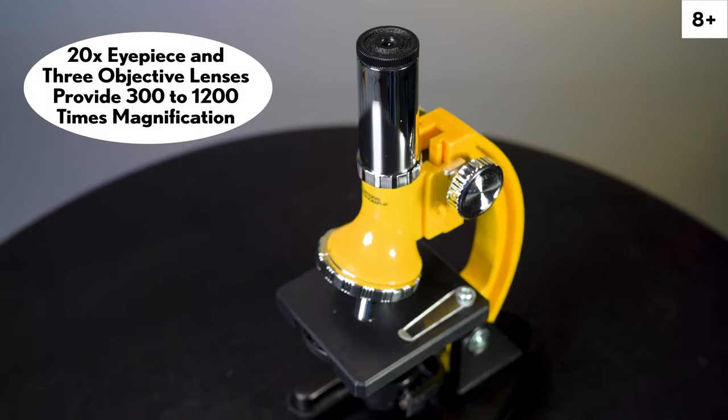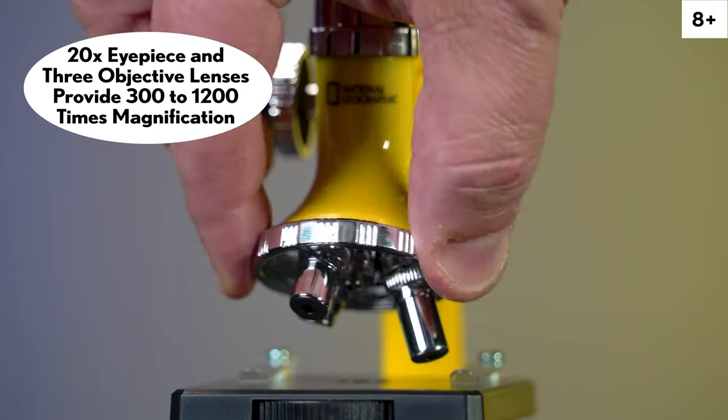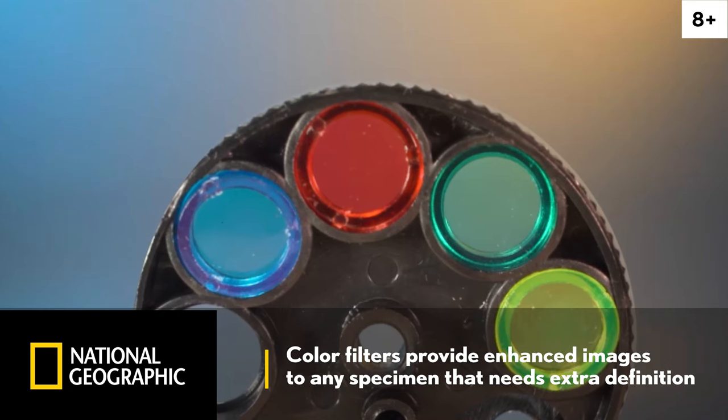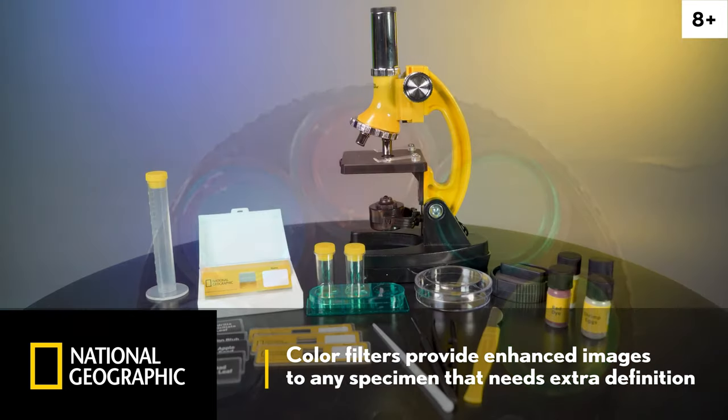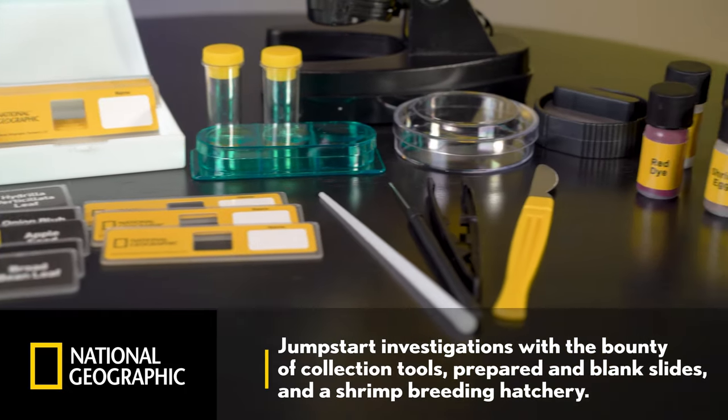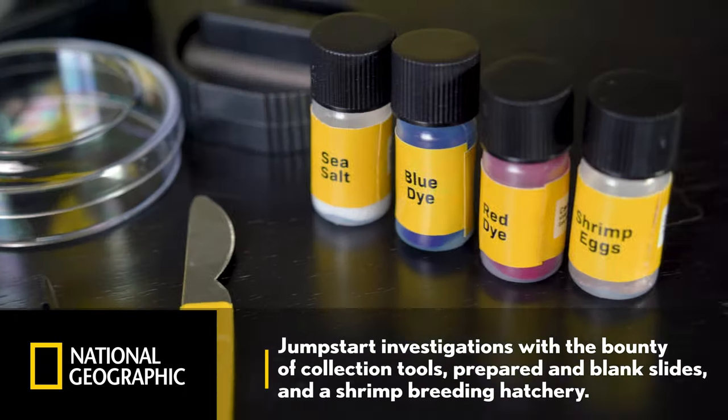The 20x eyepiece and three objective lenses offer a versatile range of magnification powers from 300 to 1200 times. Color filters provide enhanced images to any specimen that needs extra definition, and jumpstart your investigations with the bounty of collection tools, prepared blank slides, and the shrimp breeding hatchery.